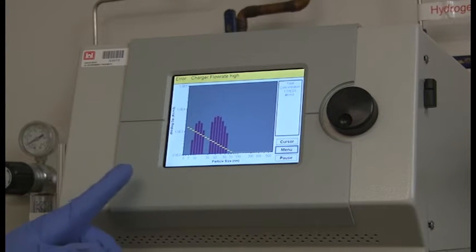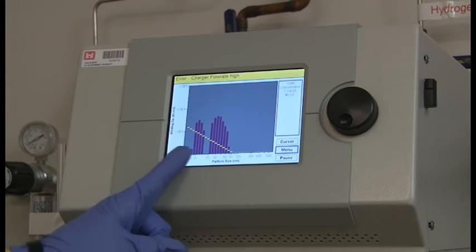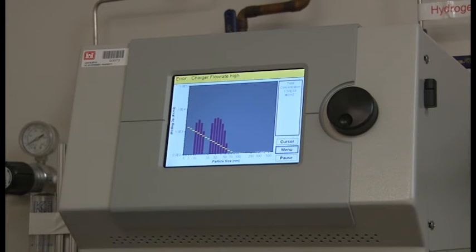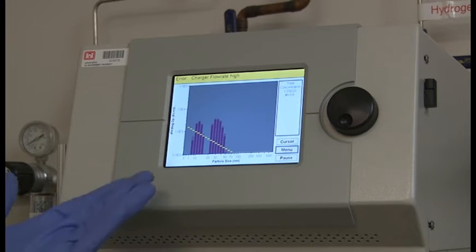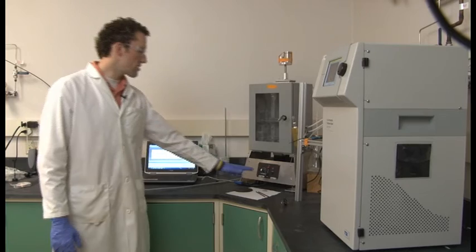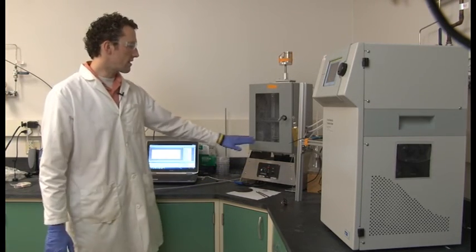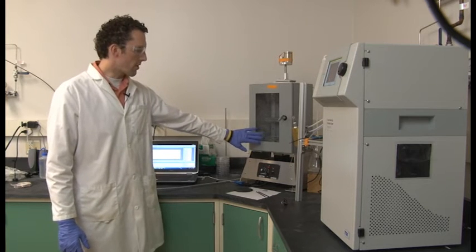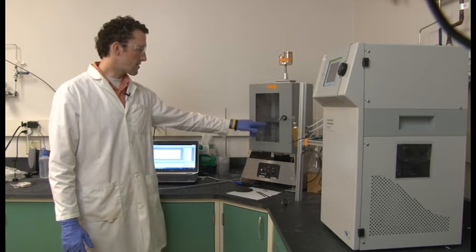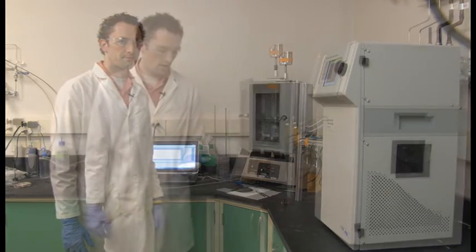In this case, as we abrade the nano bronze, we see a peak in the 7 to 15 nanometer range and another in the 20 to 50 nanometer range. The bronze nanoparticles are about 40 nanometers in size, so we could have release of nanoparticles with this abrasion. Once the abrasion time is complete, we shut off the abrasion and allow the system to return to baseline. You can see on the surface where some of the particles have attached to the window, and you can certainly see inside the chamber the particles that have been released during the abrasion.